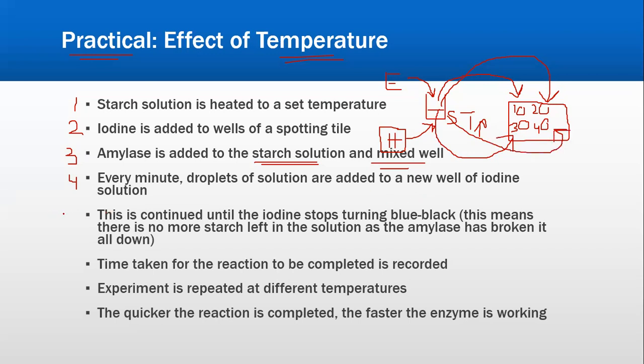This is continued until the iodine stops turning blue black. Here it will turn blue black, here it will turn blue black, here also blue black. Let's say at the 4th minute, the iodine drop does not turn blue black.